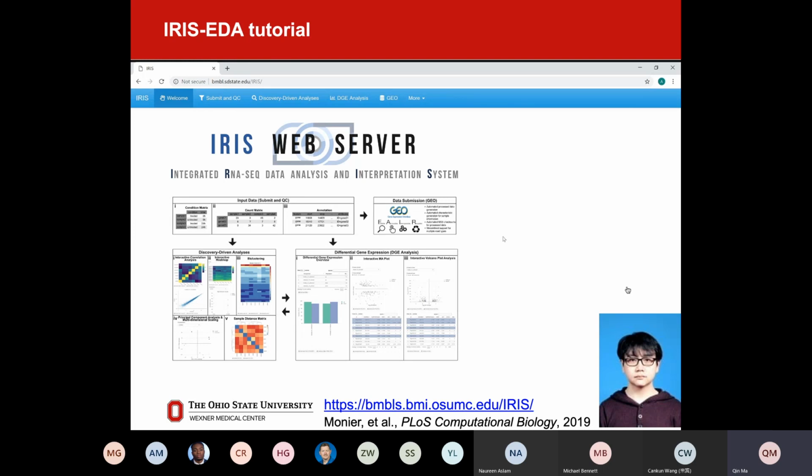Then you can really talk with your computer. You just let them know, I need more differential expressed genes, and then you can just adjust the cutoff on the server, and immediately you will get an updated gene list. So more interactivity. That's something we will definitely introduce tomorrow.